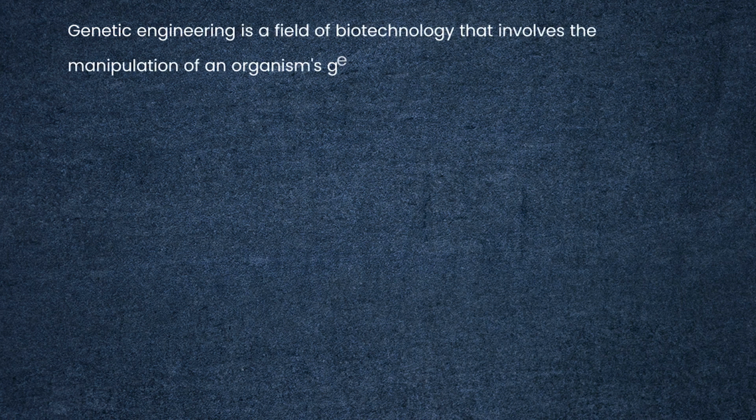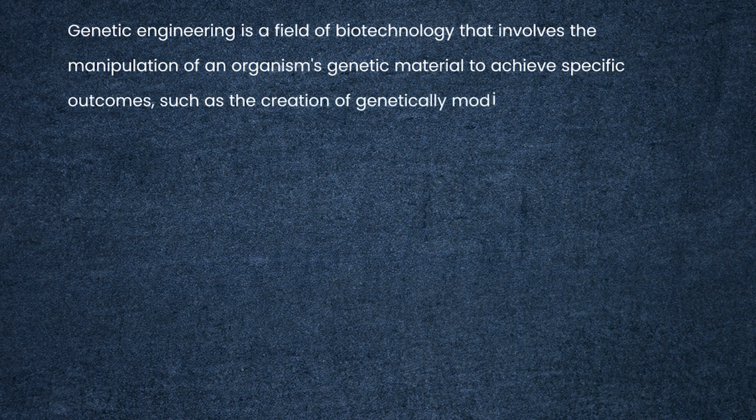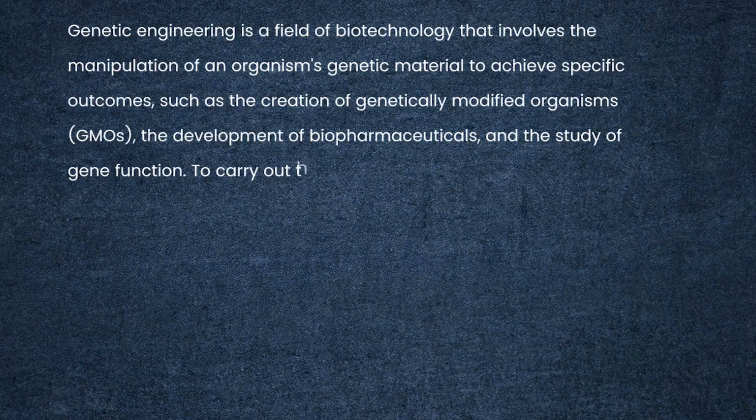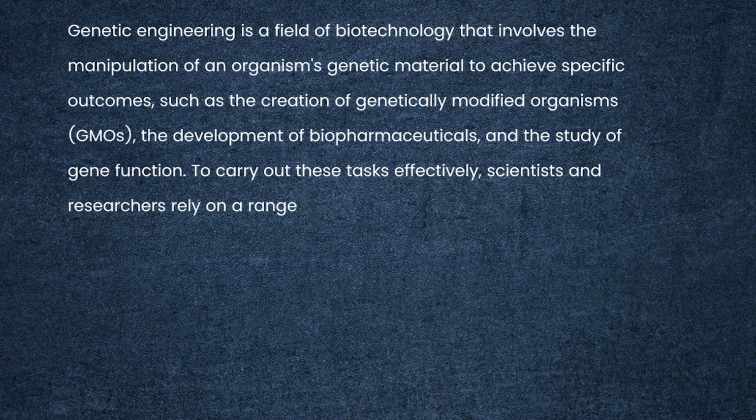So genetic engineering is a field of biotechnology that involves the manipulation of an organism's genetic material to achieve specific outcomes such as creation of genetically modified organisms, also known as GMOs, the development of biopharmaceuticals and the study of gene function. To carry out these experiments effectively, scientists, researchers and workers rely on a range of specialized instruments and equipment.